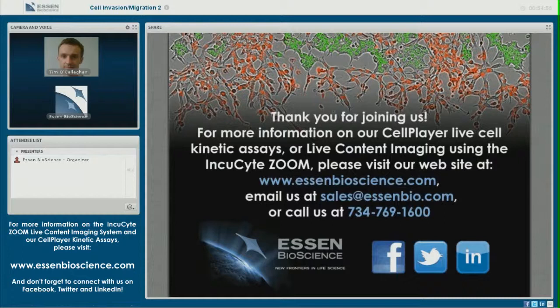A further question is, do we use serum in most of the migration assays? So we do routinely use complete culture media which contains serum, unless required otherwise. Serum starving can be performed if you want to, of course, inhibit cell proliferation.